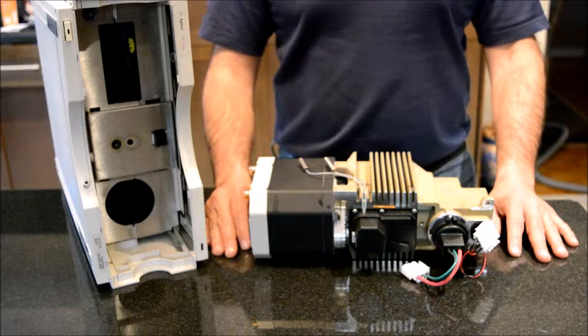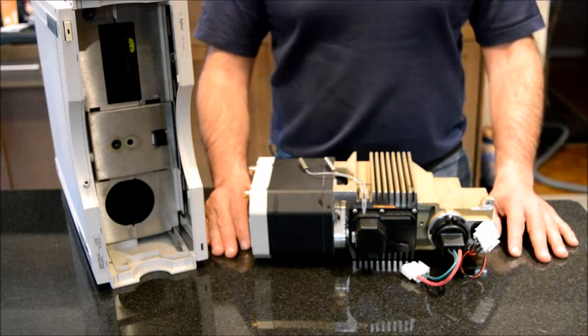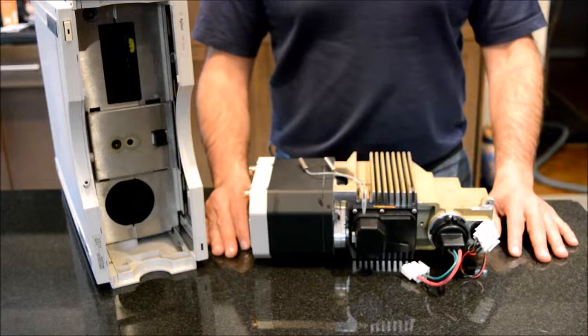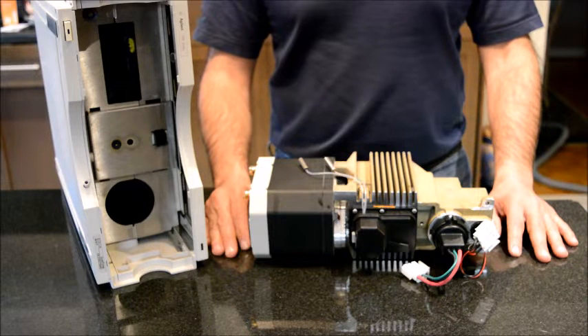Hello everyone, and thank you for choosing to watch another video from this channel. Today I'm going to talk about the Agilent HPLC UV detector and the problems that you may encounter during your HPLC analysis that relate to your detector.